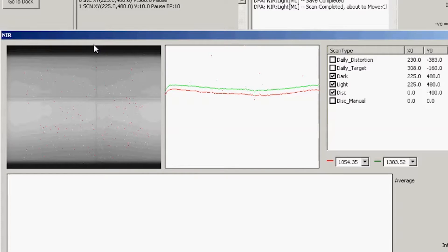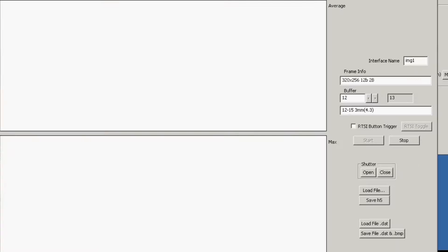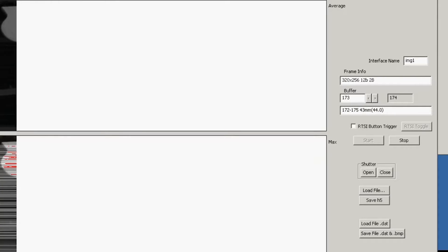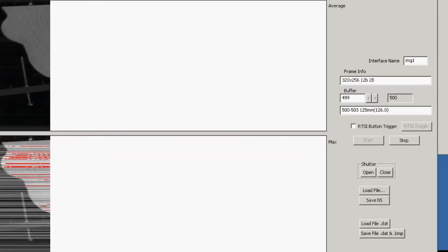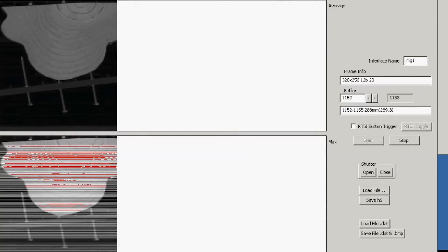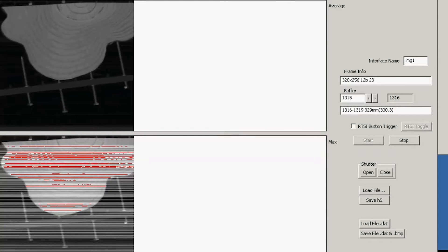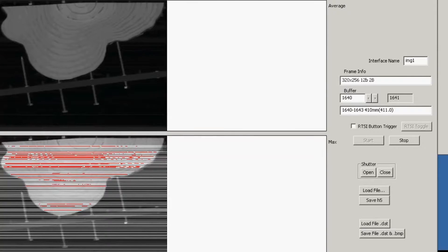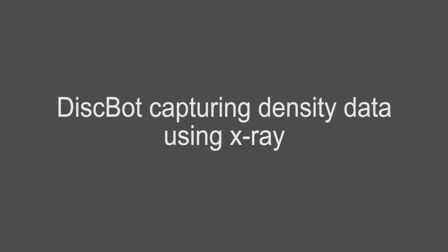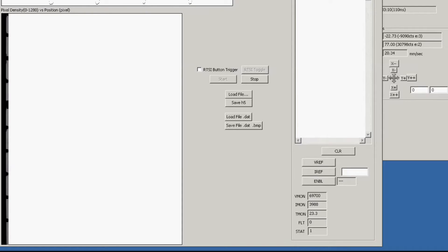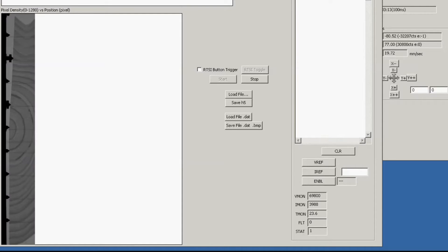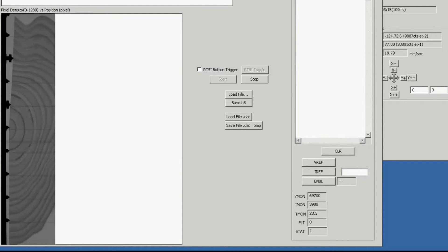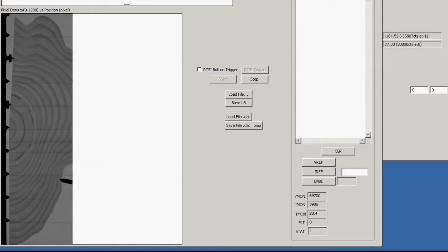Knowing the proportion of these chemicals allows us to predict the response of wood to varying environmental conditions. The X-ray scanning system consists of an X-ray source and an X-ray inline camera. The X-ray image is used to determine wood density.